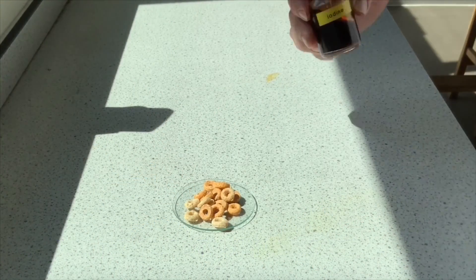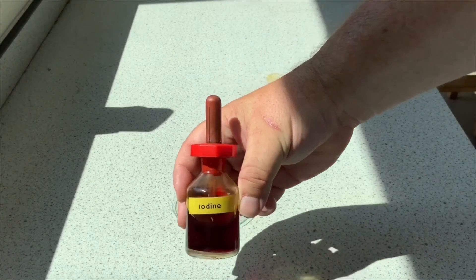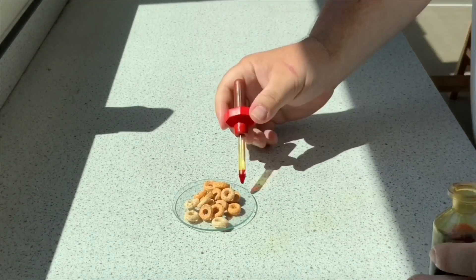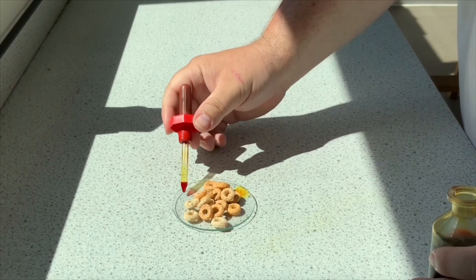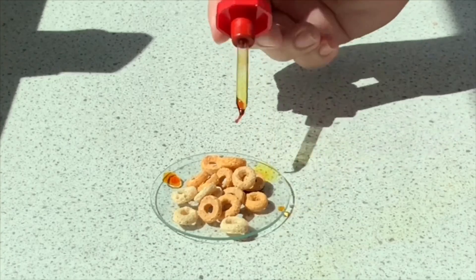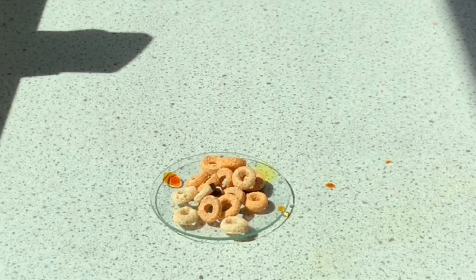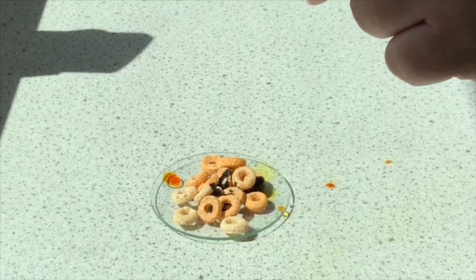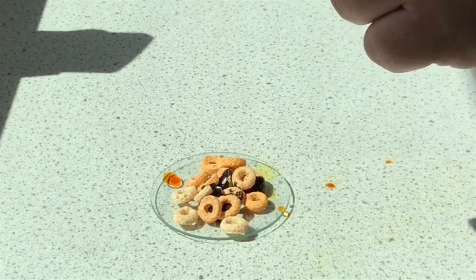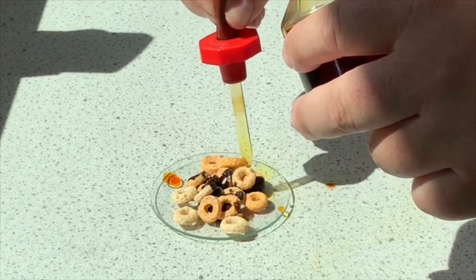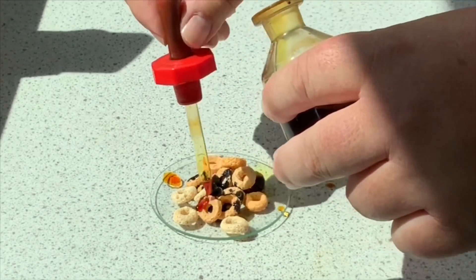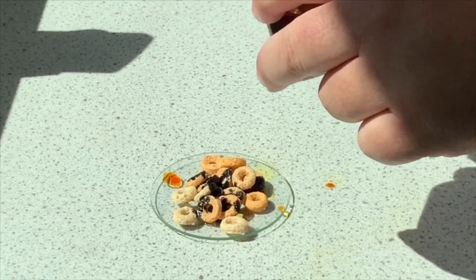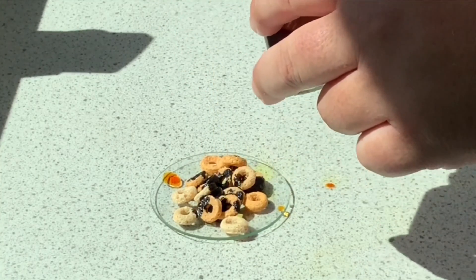First of all, we're going to test for starch using iodine. I've got some cereal here and some iodine. Iodine, when we look at its original color, is like an orangey brown color, and when starch is present we can see the color change to a dark blue-black color. Normally we carry this out in a test tube where we crush up the food first, then put a few drops on, but this experiment illustrates it perfectly well.